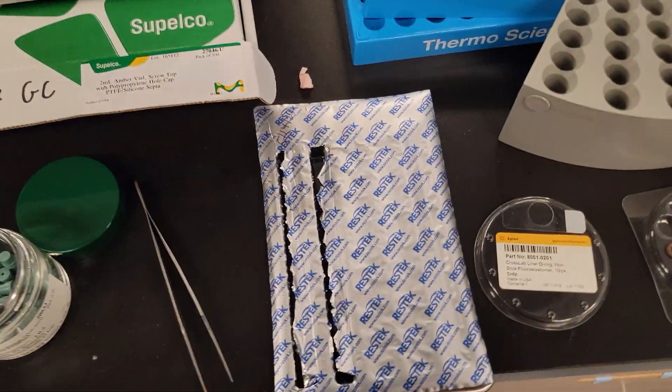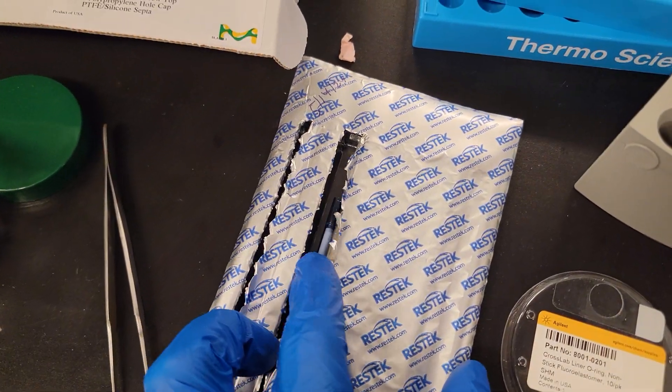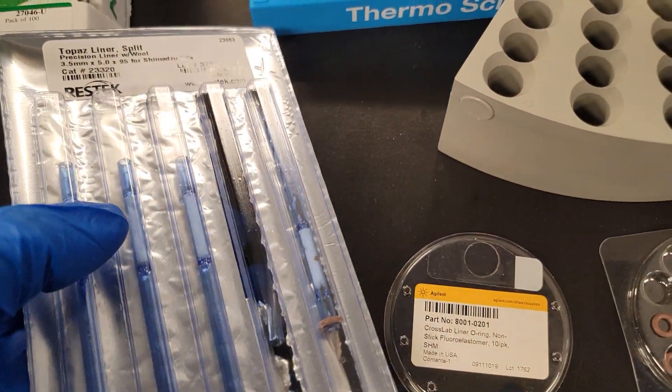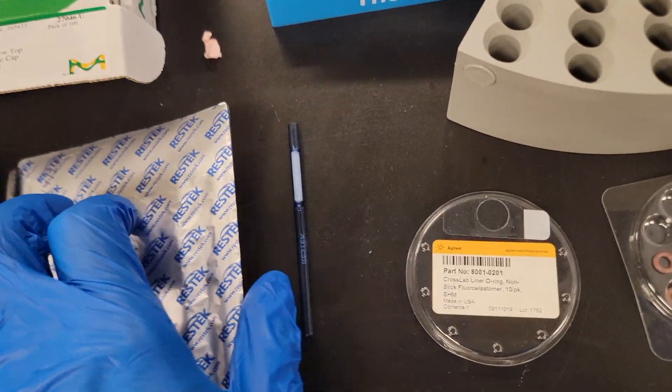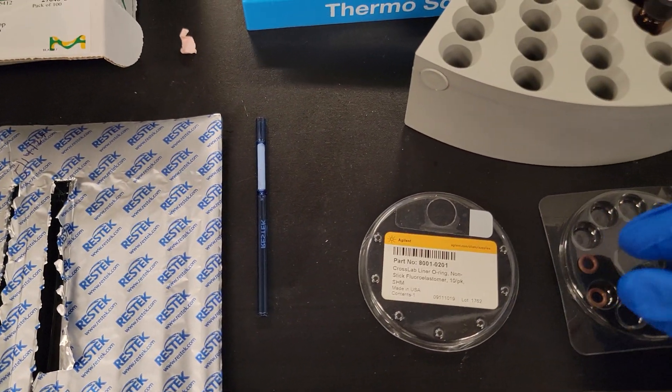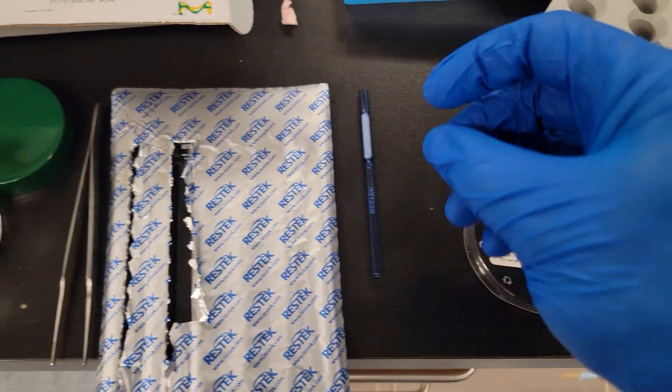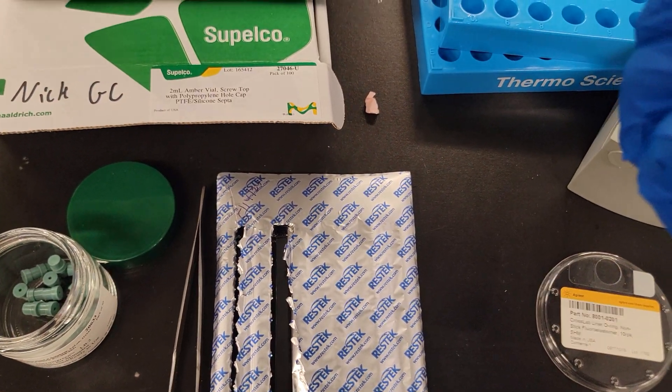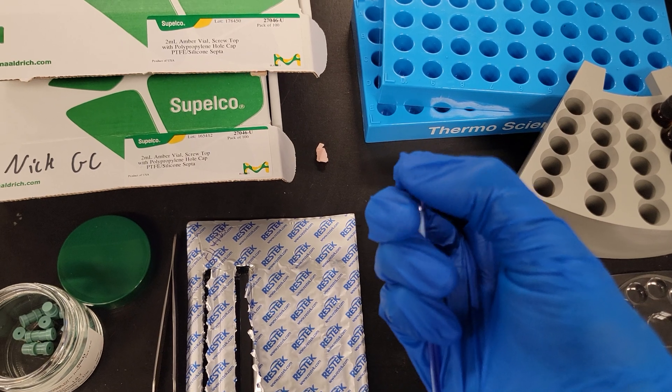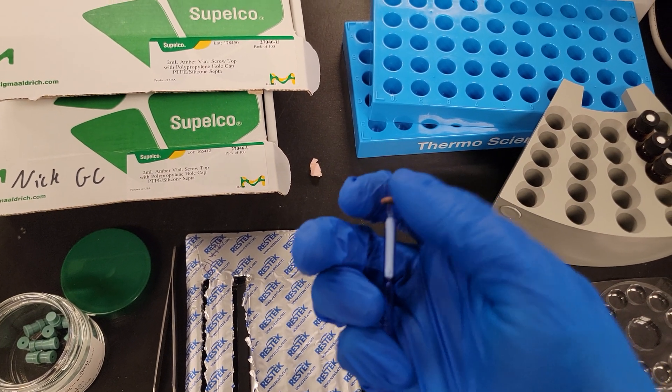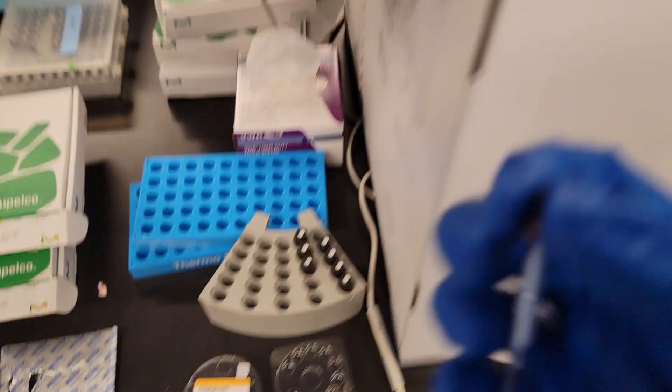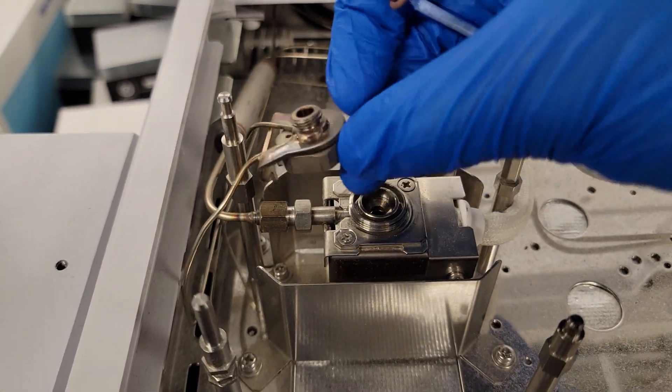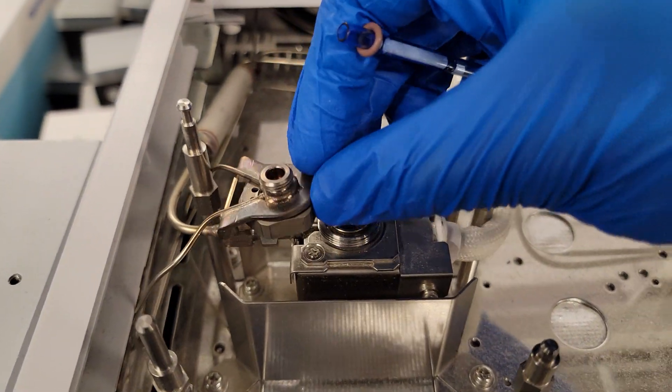We'll grab a new one. I just opened this one. We need to put one of these o-rings around here. When you put the o-ring on, you should slide it down further than it needs to go, because when you drop it in, you want it to be as low as possible. That's the only way to guarantee that.